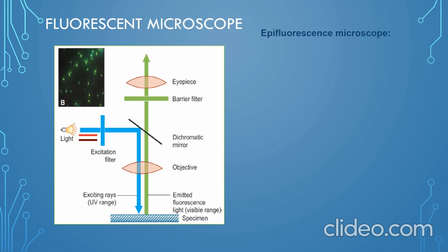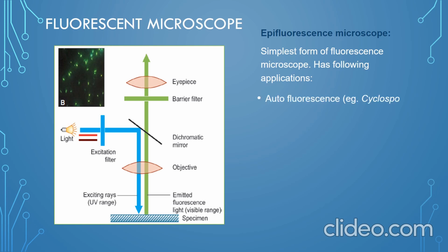What is the working principle here again? If you use fluorescent dyes, they will be exposed to the UV rays, become excited and fluoresce. That is, they convert shorter wavelength rays into longer wavelength light. That is the exact principle of fluorescence. Even that is used here in this microscopy. A mercury lamp, or nowadays LED also is available. The mercury lamp emits rays that pass through an excitation filter. The excitation filter allows only shorter wavelength UV light to pass through.